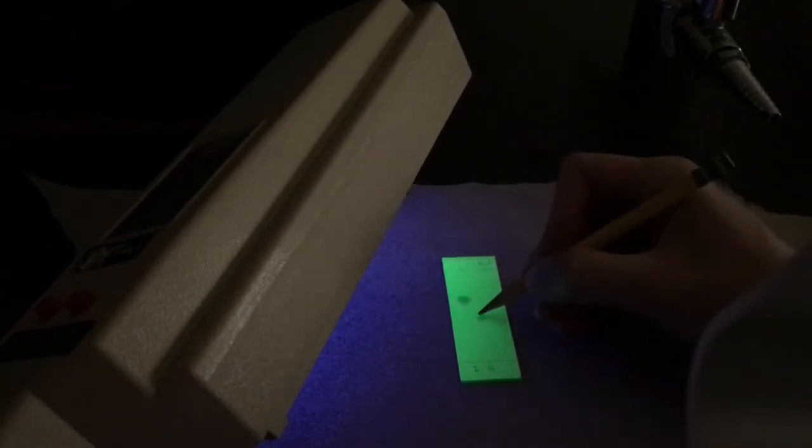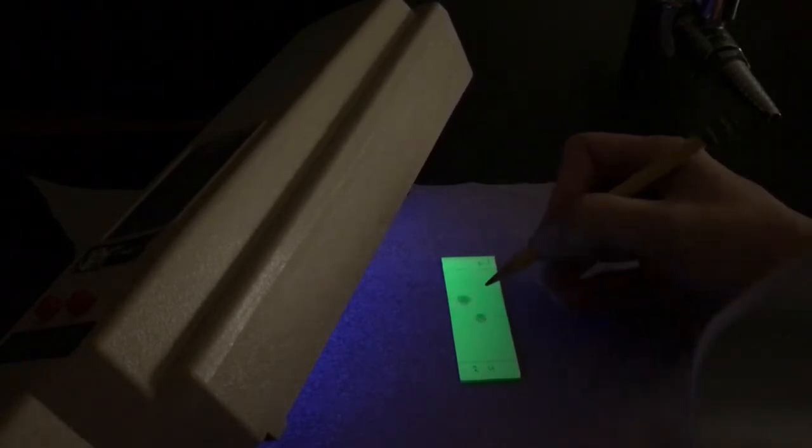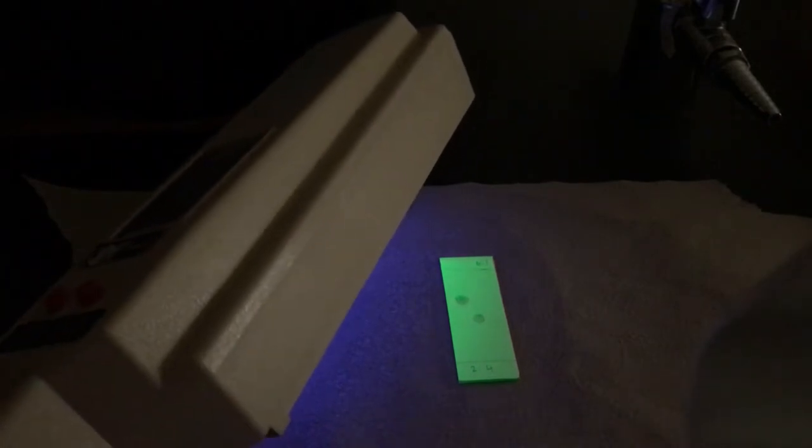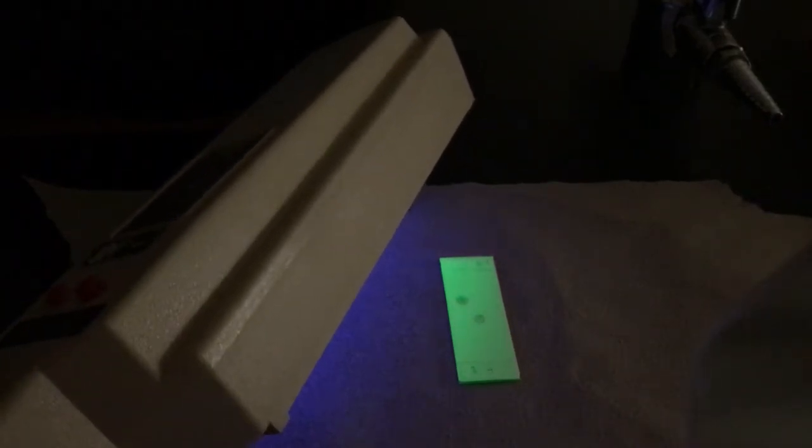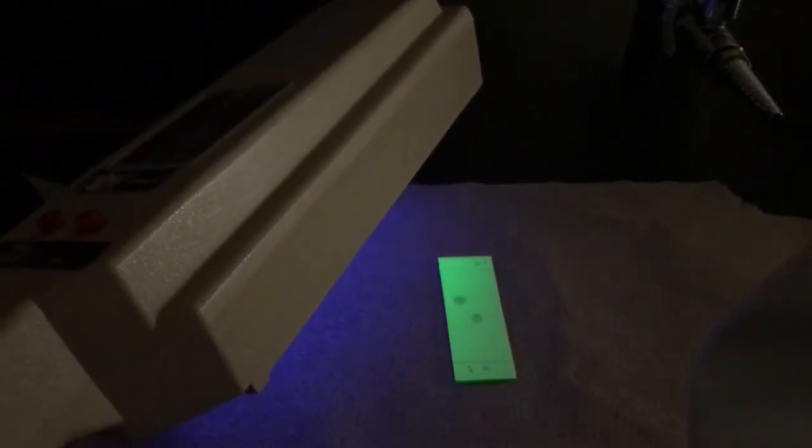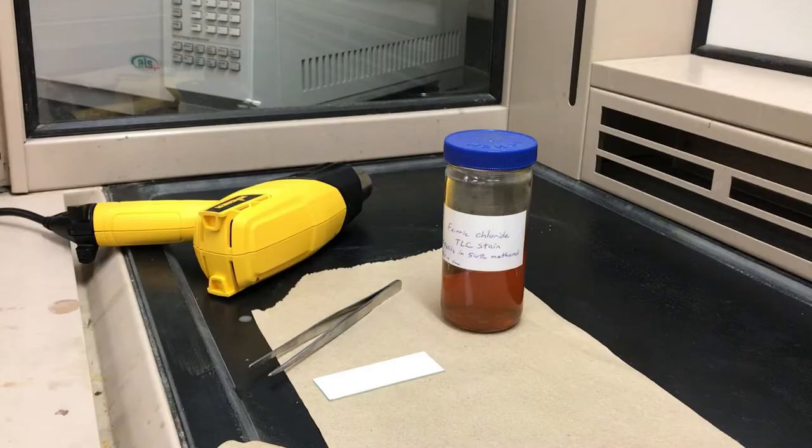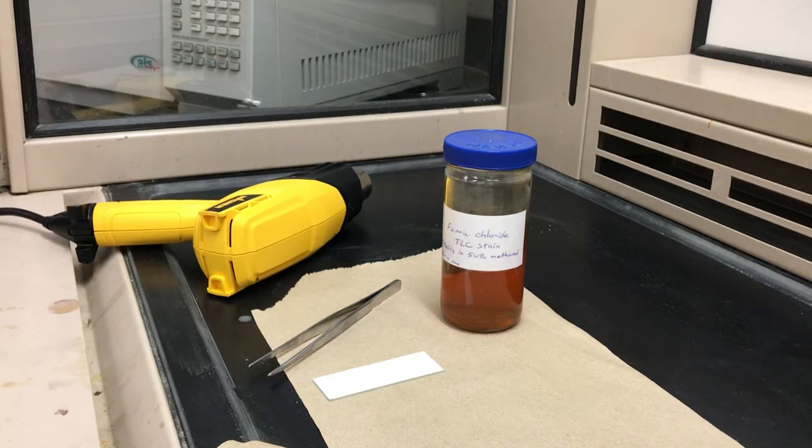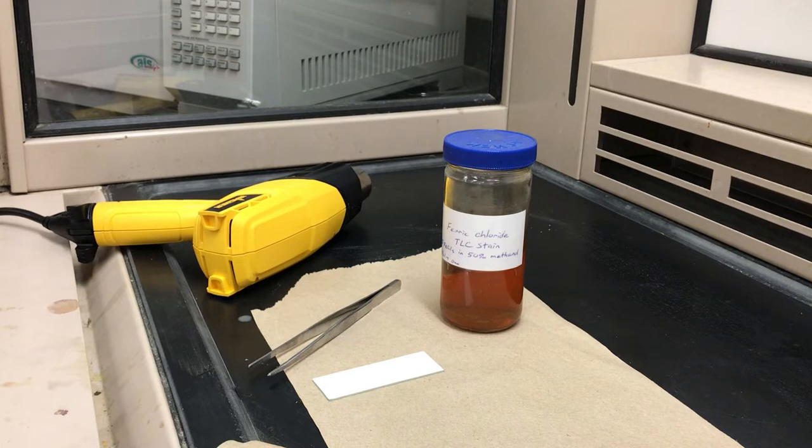What you can do is take your pencil and circle those spots because when you take the UV lamp away they are going to disappear. UV light is non-destructive so the compounds haven't been changed after you've tried that method. So pretty much everyone will try that first, but you can then take the plate and then follow it up with another method.